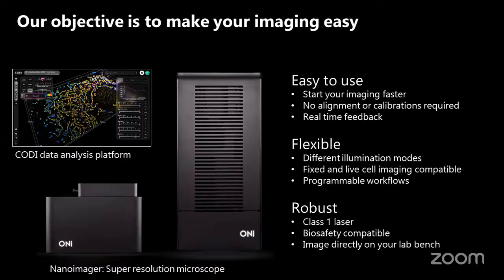So we also do fixed cells, and we also give you an option to do live cell. That is good. So you can put your CO2 cylinder connected to the microscope. You can image for 24 hours or 48 hours, and so on and so forth.